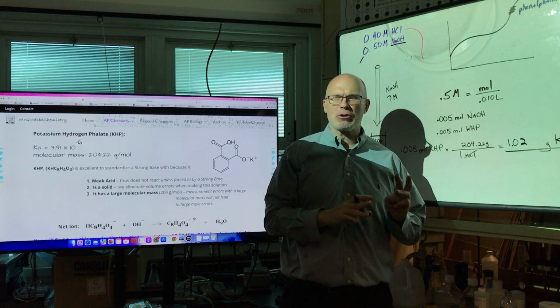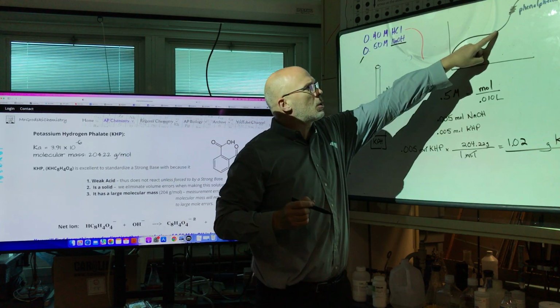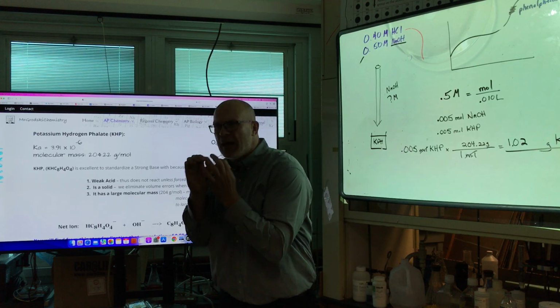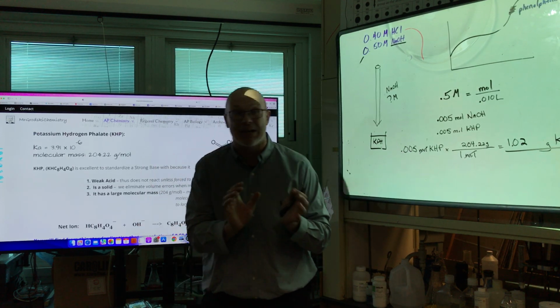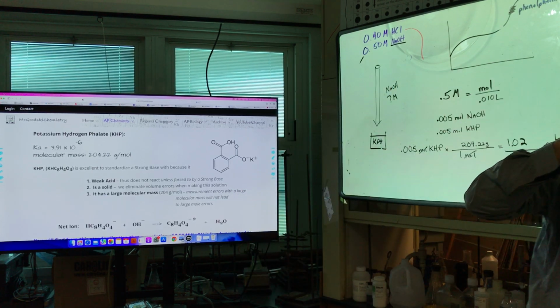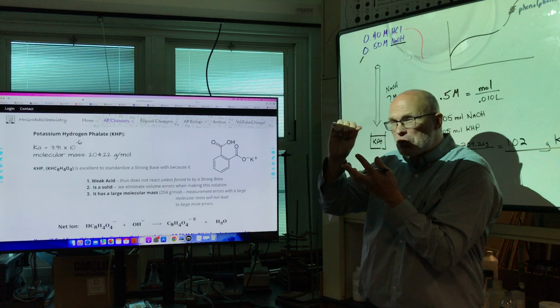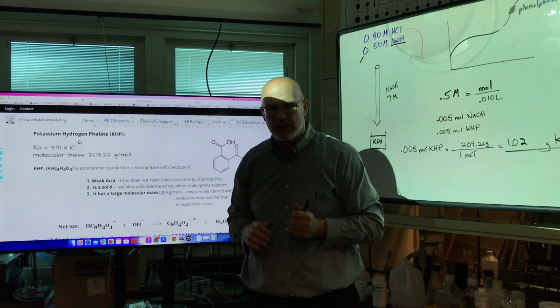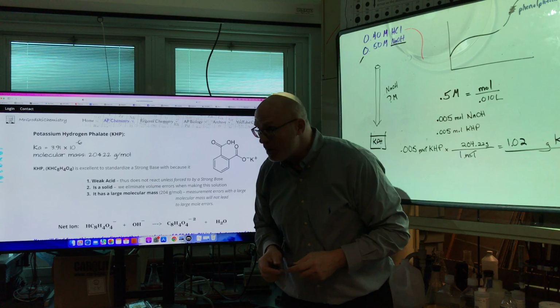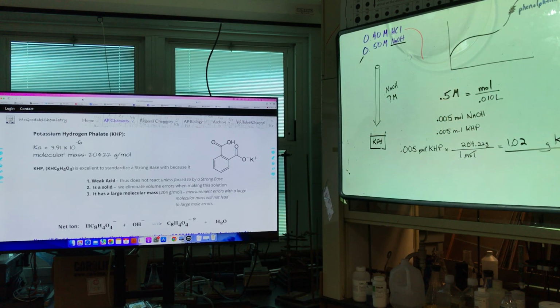So we're going to drop 3 drops of phenolphthalein, and it'll be colorless. When you start getting close to the equivalence point, the pink or fuchsia color, or whatever color you guys tell me it is, is going to start to persist. You slow down drop by drop until 1 drop makes the color persist just slightly for 30 seconds. If you mess it up, you start again. That is the standardization, and that's what you have to do before you back titrate.